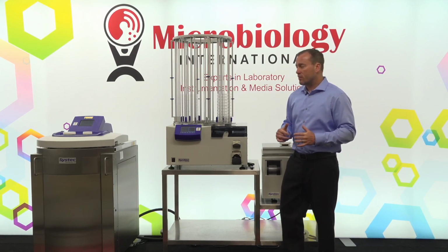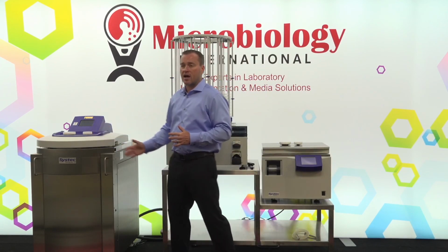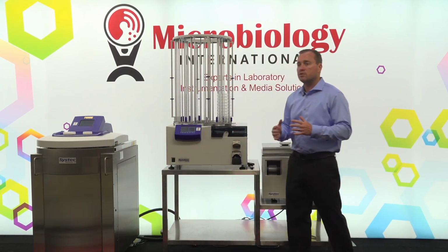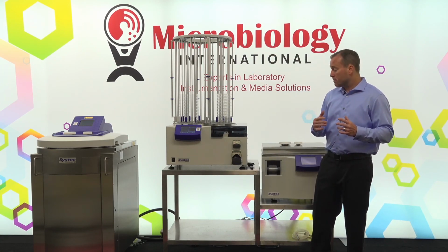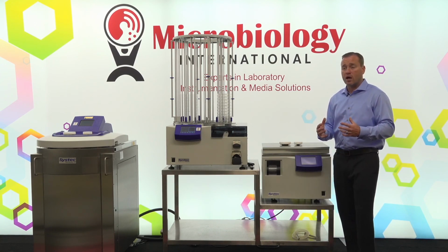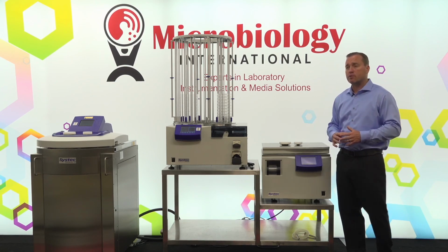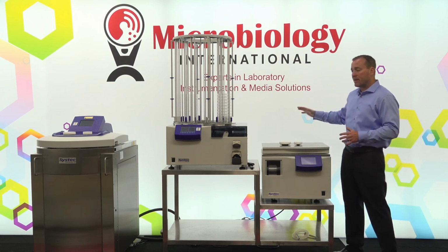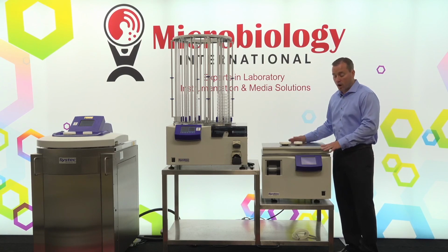The capacity for that is most likely not enough to fill the actual unit for any type of media preparation, so you would still be relying on the source that you're currently using for creating demineralized water. But if you don't have hard pipe demineralized water in your laboratory, we would have all of the plumbing and all the tubes that we would need in order to hook our Easy Water Pro system into the back of the unit for the filling of the vessel water.